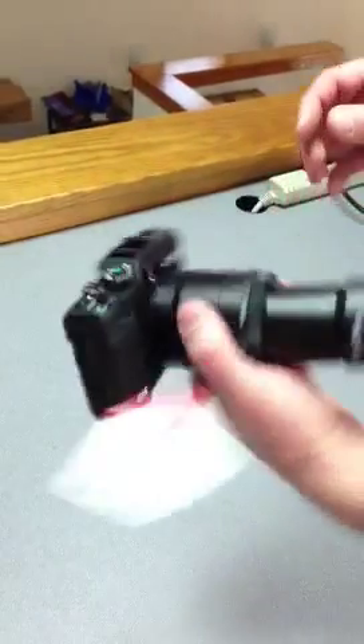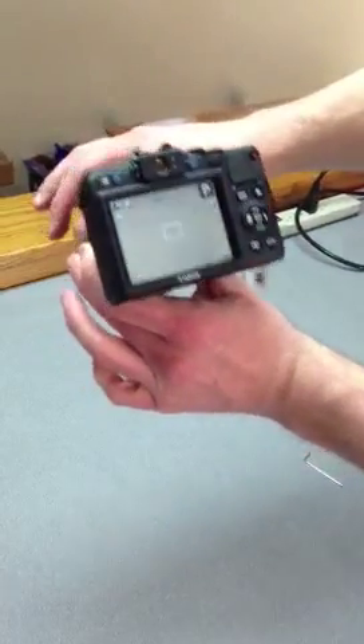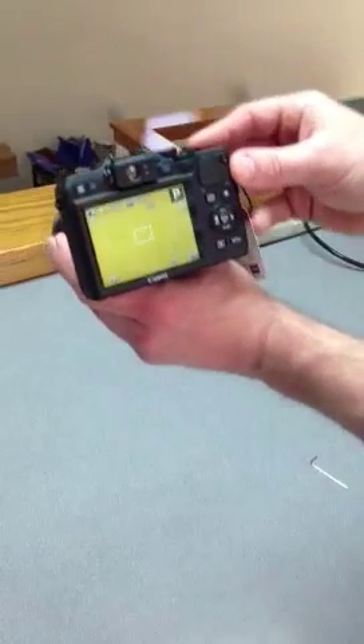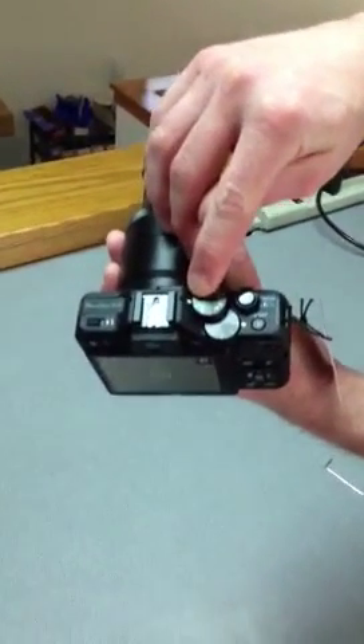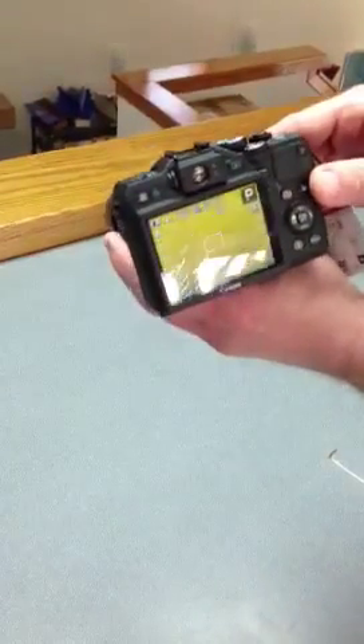In review: once you get this mounted and slid into your microscope, set the distance, turn the camera on, zoom all the way in, operate in P mode, and then the only adjustment you have is the exposure brightness — and you're ready to take pictures.